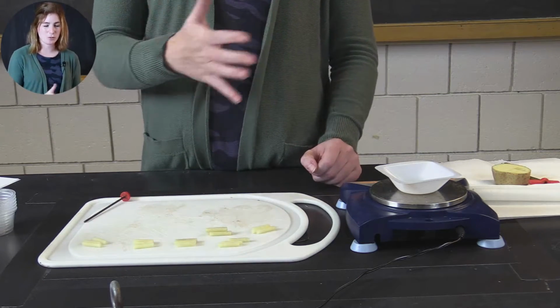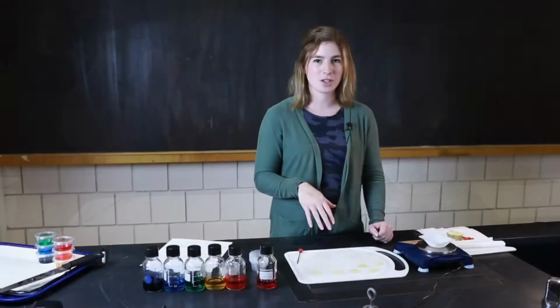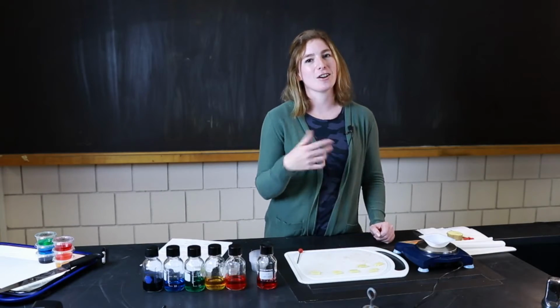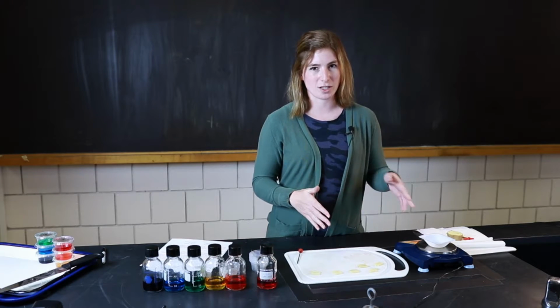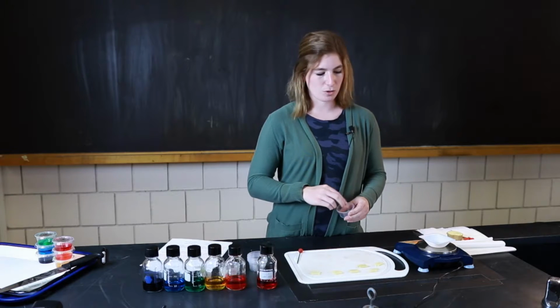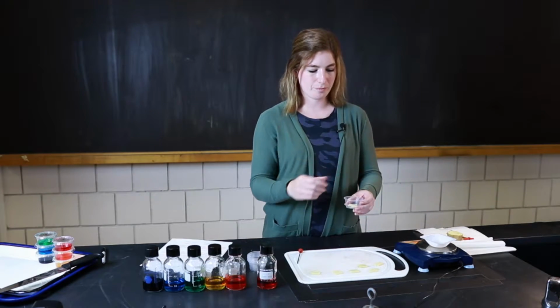I'm not going to read you the mass that I see in front of me right now, because the initial masses you use are going to be from the potatoes that I already took the initial mass of yesterday. So I'm just going to show you what I would do once I took the mass. I'd record the mass of these potatoes and then put them into their cup.